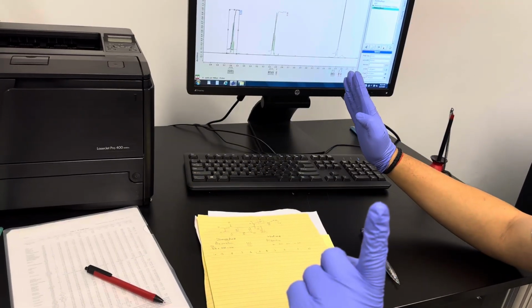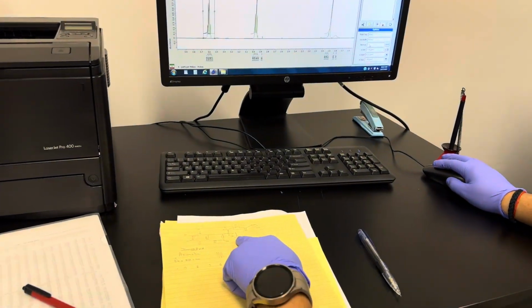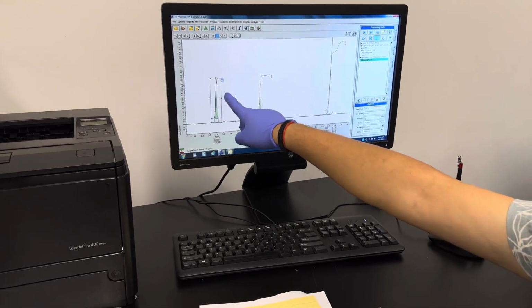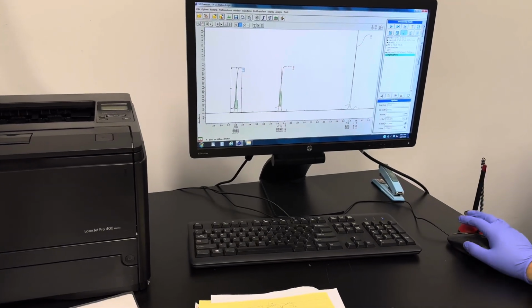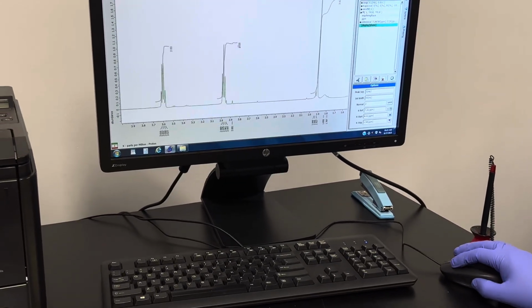But one you should know. So since we know this is the 2, put 2 here and enter. So the 0.5 became 2, this also became 2, this also became 3, right? So this is done.